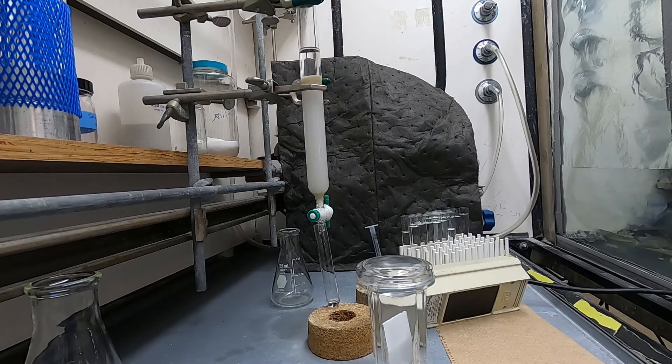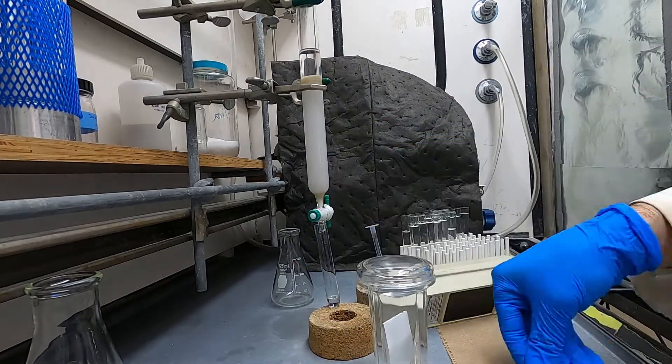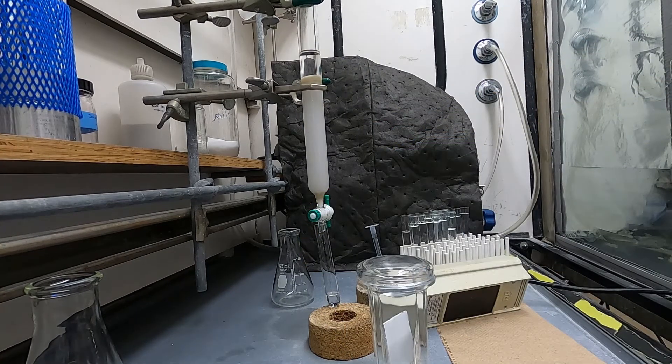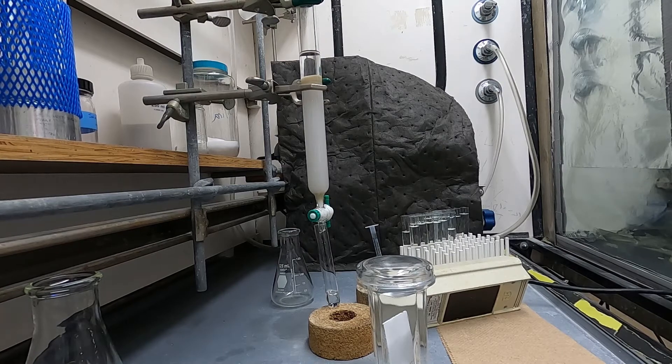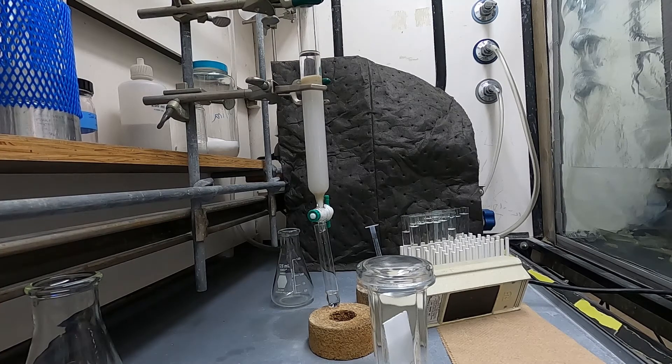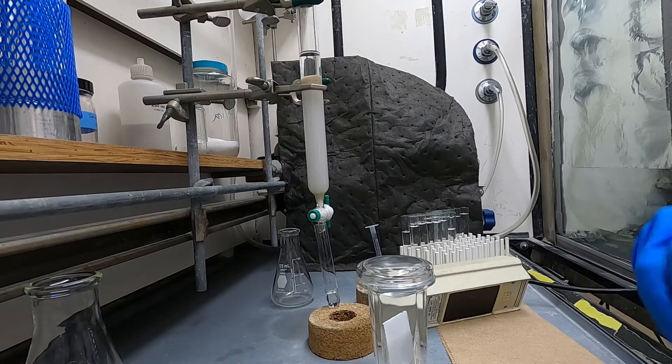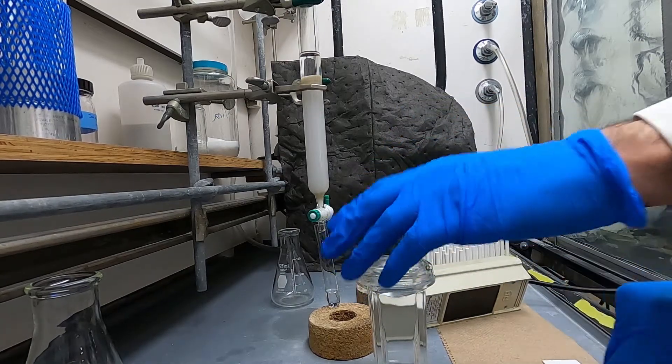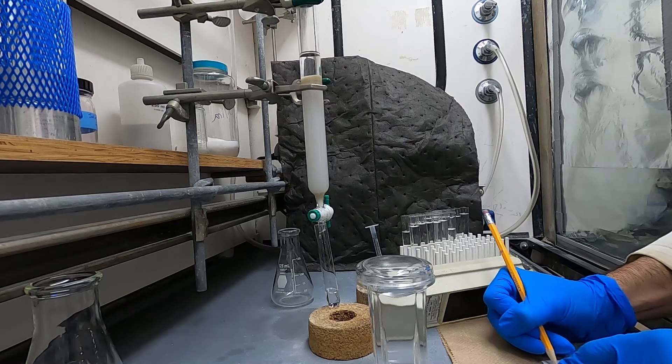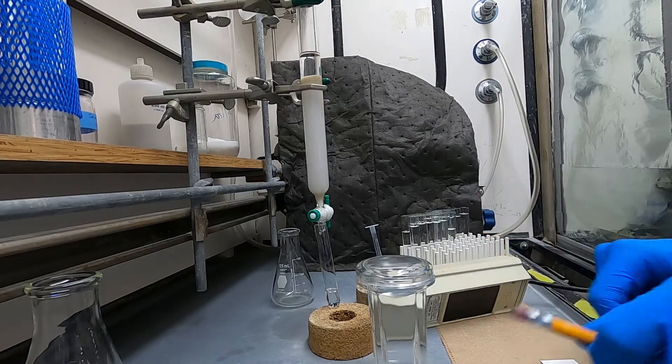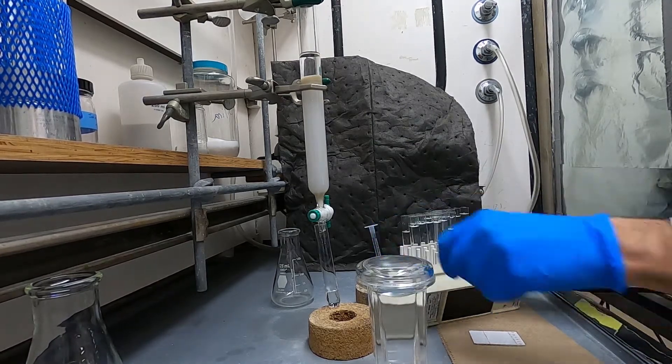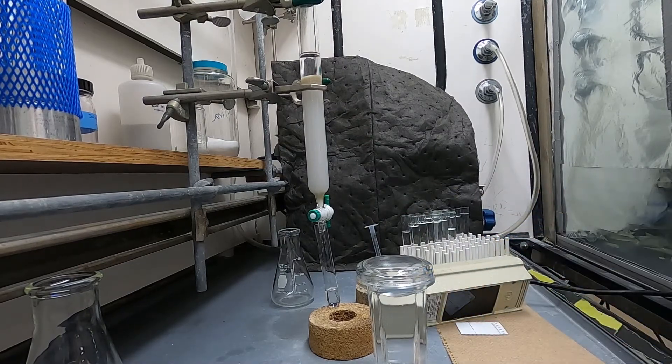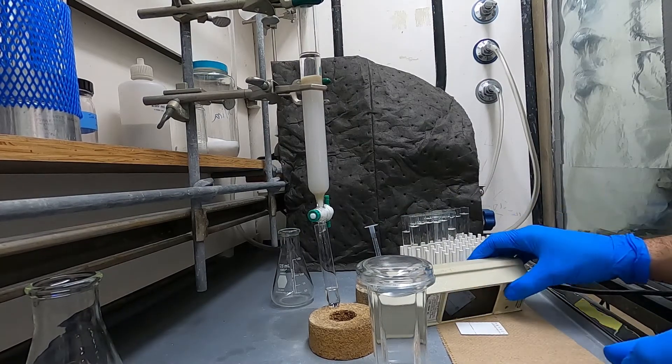And if that happens you'll oftentimes just have to run the column again so it is better to take things slowly and try to do it right the first time rather than having to run the column twice but sometimes it just happens that way. There was a brief flash of a probe TLC that I did and you could see that there were I think five or six spots and so I'm hoping that I at least get a good separation and get the major spot by itself.